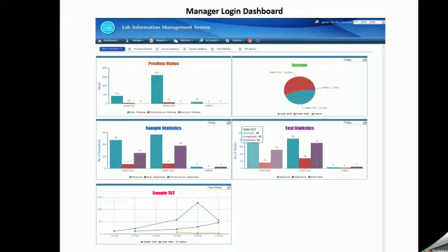Workflow and planning of resources. The dashboard shows at a glance details like: 1. Pending sample details in each stage, like testing pending, verification pending, and publish pending for all the laboratories. This information is useful for managers to take corrective action in each laboratory. What samples are pending in each stage can be ascertained by using the drill down option provided. 2. Income generated.